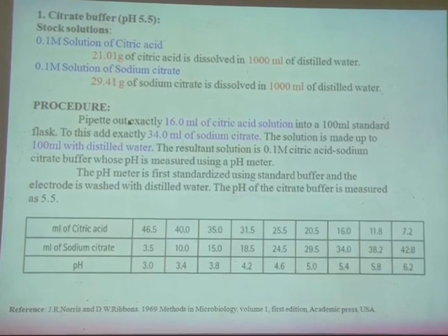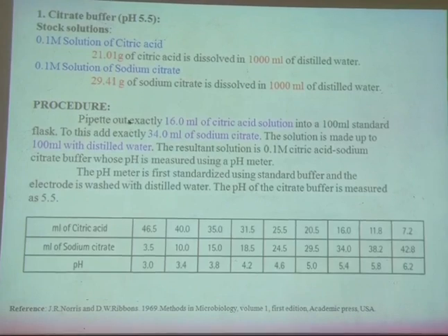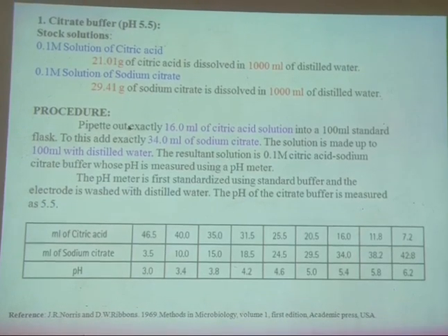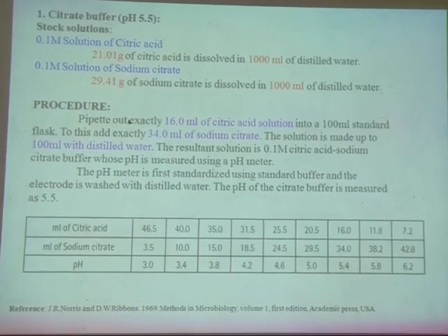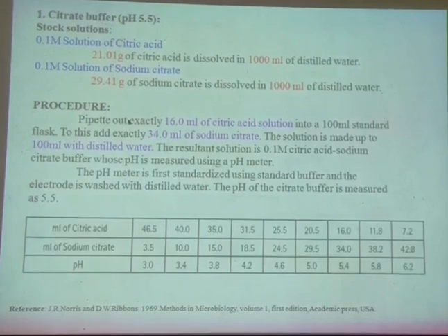If you want to work with any biological system or any biomolecules to study structure, function and enzymatic activity, to prepare a cell-free extract, or to work with any fluid, you need to provide the proper environmental conditions as in the native form. That simulation should be given. That's why the biological buffer system is very important.